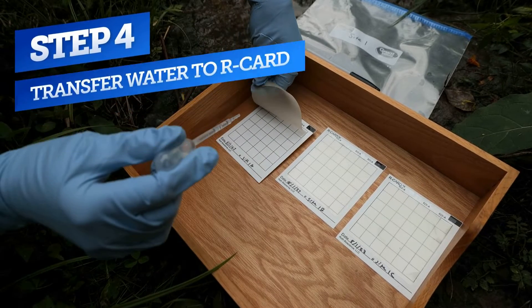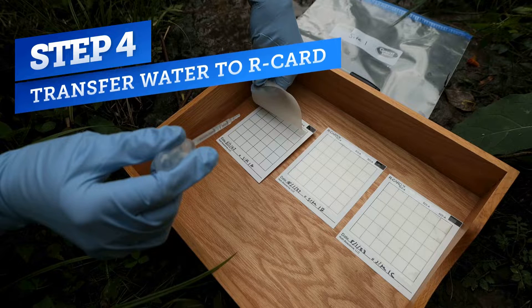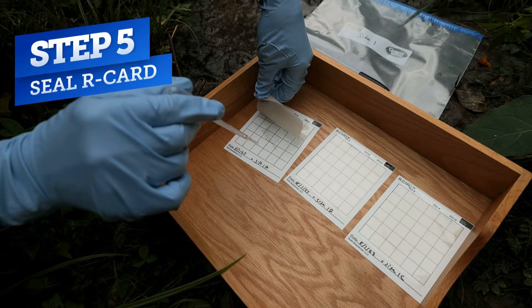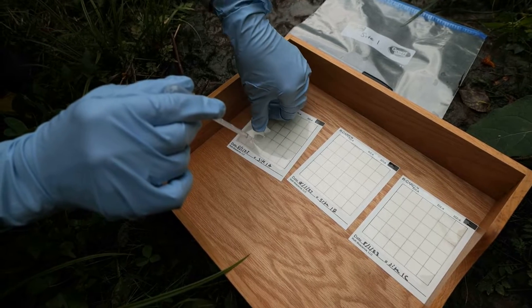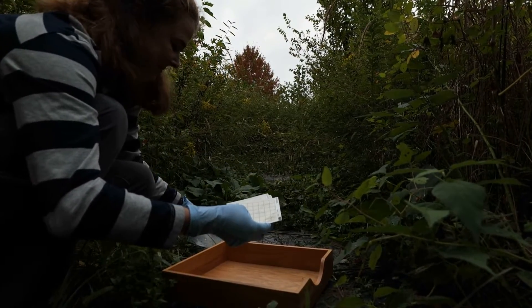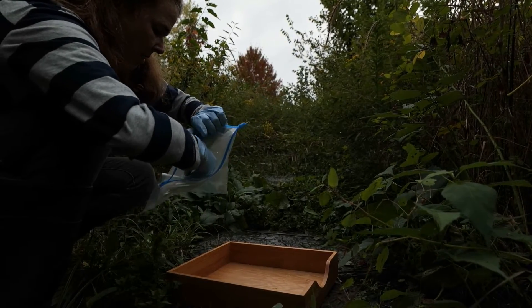Now we will inoculate the R-card. Carefully lift the plastic from the bottom corner and dispense the one milliliter sample onto the center of the card by squeezing the bulb. Next, let the plastic film drop back onto the card and the liquid will disperse evenly. After about one to two minutes, the formulation on the film will gel, allowing you to place the R-card in the Ziploc bag for transport. Repeat the entire procedure twice so that all three cards are inoculated.